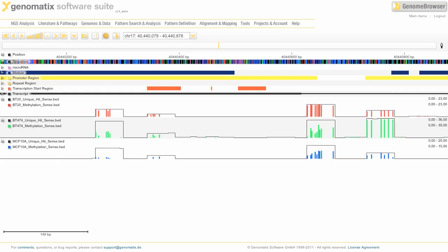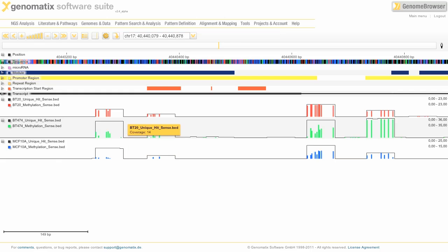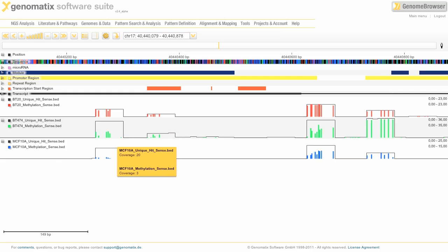And here you can see that some regions are not covered at all. And that has to do with the RRBS enrichment protocol that was used here. Now the bars here indicate to you the fraction of methylation that we're seeing here. So in this case we see complete methylation because the bar is as high as the black line. And down here we see a lot less methylation.